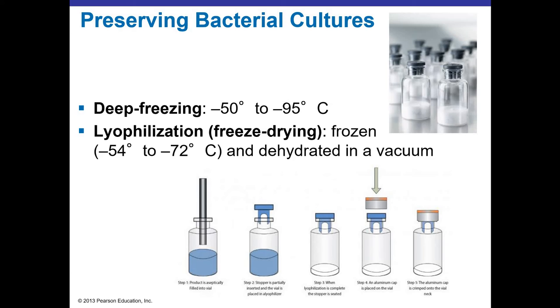So preserving bacterial cultures is very important in making sure that we have the stocks available to be able to study or do whatever we need in the research and or clinical lab.